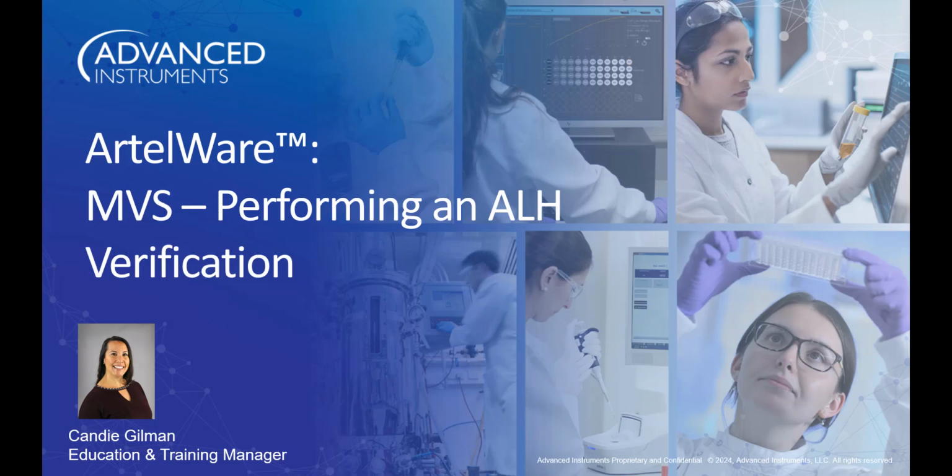Thank you for joining me for this short video that walks through performing an automated liquid handler verification on the MVS system with the ArtelWare software application. I've got some interesting information to show you, so let's go ahead and get started.